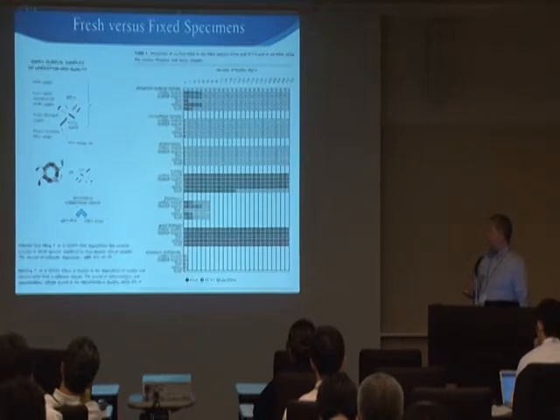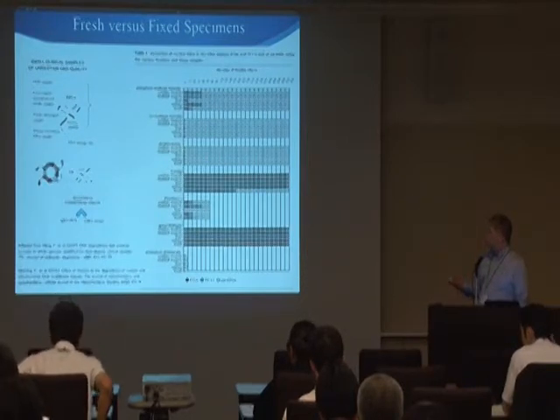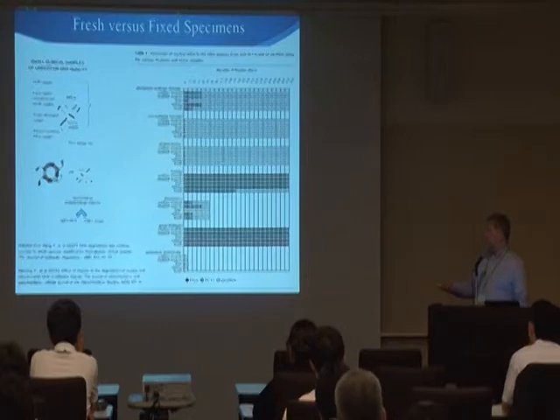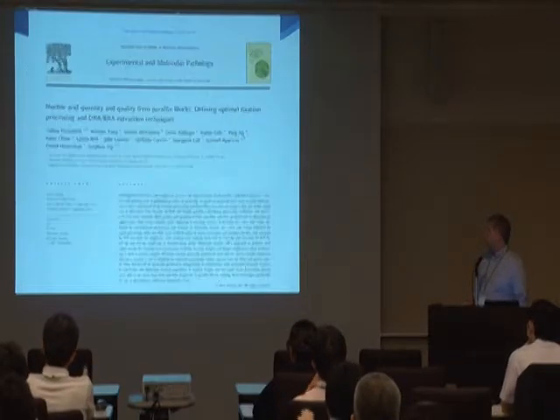And of course, depending on what kind of fixation method you use for your cells, whether you use phosphate buffered formalin or non-buffered formalin, alcohol formic acid, Carnoy's fixative, which is a standard cytogenetic fixative, and a bunch of other types of fixative, you can get very variable quality in the preservation of nucleic acids. What happens is that all of this material that gets fixed gets degraded, the fragment sizes get smaller and smaller, and at some point it becomes very difficult to use them in downstream assays, whether that be quantitative PCR, other kinds of PCR, or microarray experiments.